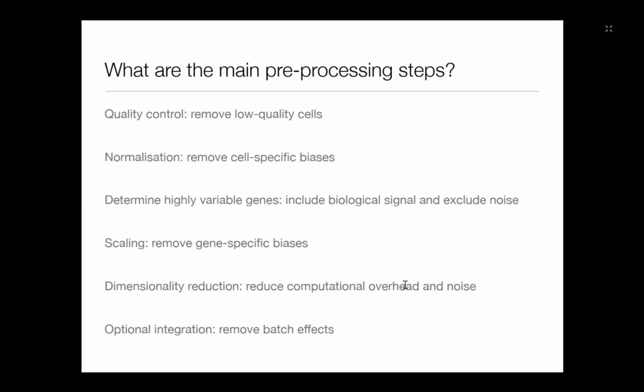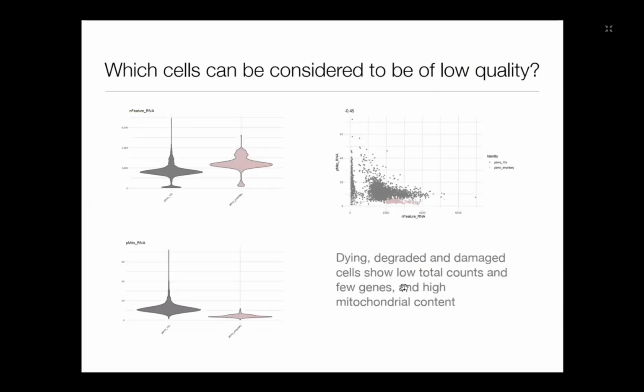First, quality control. On the top left plot, what we're seeing is a distribution of the number of genes we can detect in a cell. Imagine the gene counts table again. For one cell, so one column, how many genes have a count more than 0, so at least one read? This is a so-called violin plot. It's basically just a distribution.